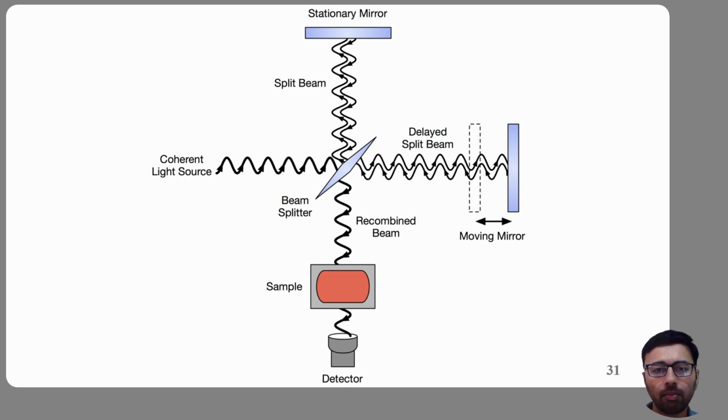At the heart of FTIR spectroscopy lies the Michelson Interferometer. This device splits infrared radiation into two beams, changes their relative path lengths, and recombines them to generate an interferogram. Finally, a Fourier transform converts the interferogram into a readable spectrum we analyze in the laboratory.